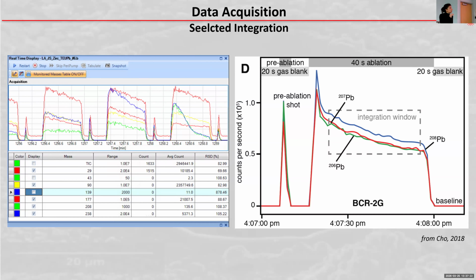So there are data collected while the laser is ablating, and here you can see a change in the phases. Ideally, in a standard material you want to have the elements all going parallel down. I don't say peak, it's not a peak, it's a spot, it's a time-resolved spot analysis. The fact that the different elements listed below there are parallel is actually good. If they don't, then it indicates that there is a fractionation. In a homogeneous material, they should be parallel. In a not homogeneous material, you actually see different phases.